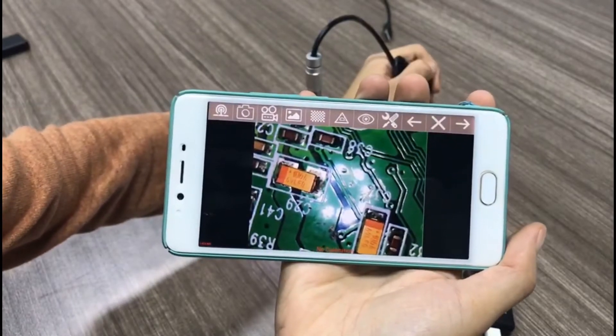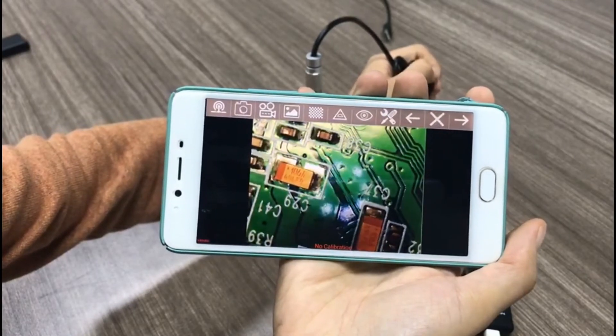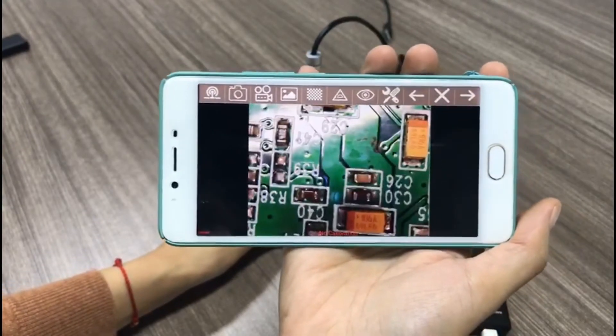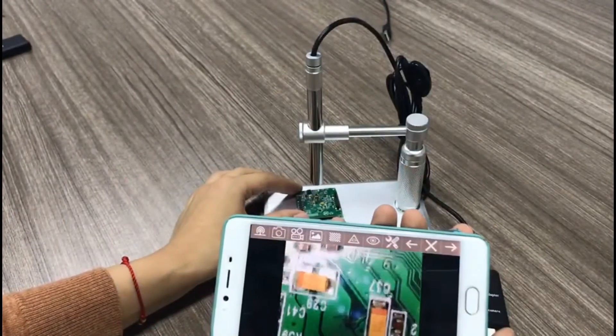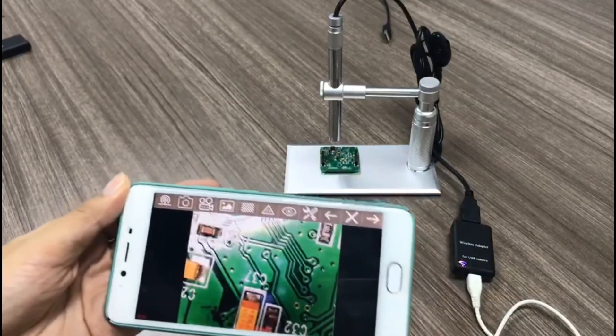You can adjust the focus controller, and also adjust the light or the brightness. Now it looks better. Maybe the light isn't perfect, but it's a budget model so I think you can accept the magnification and clarity for this price.